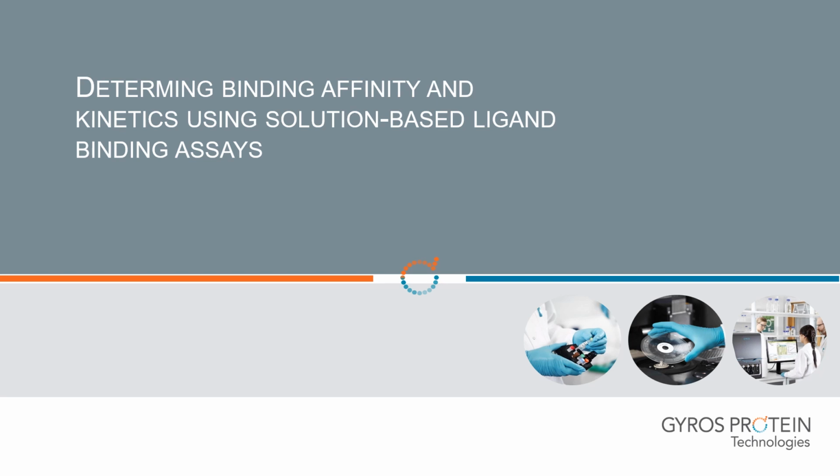Yeah, I think one of the things that we'll hopefully highlight today is to show how the Gyros is a relatively higher throughput option to screen for affinities, and it could be used as an orthogonal method to other techniques. So let's dive into it.